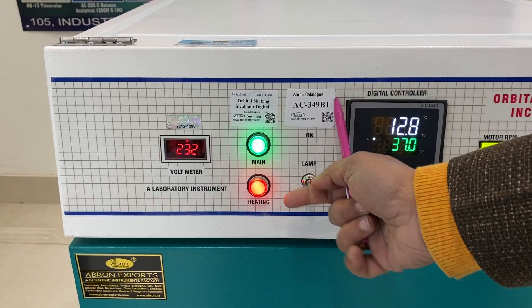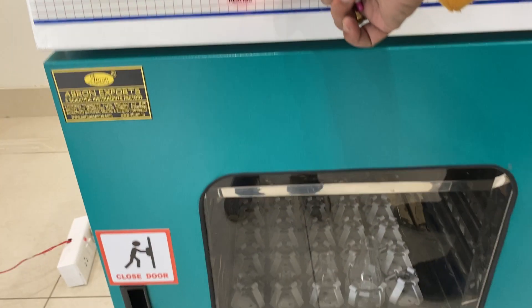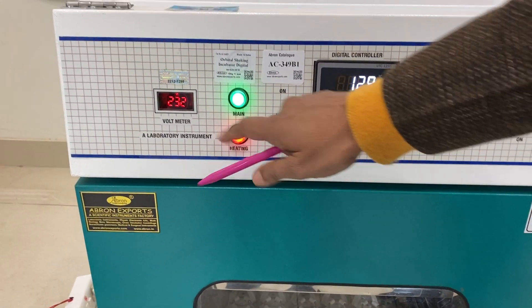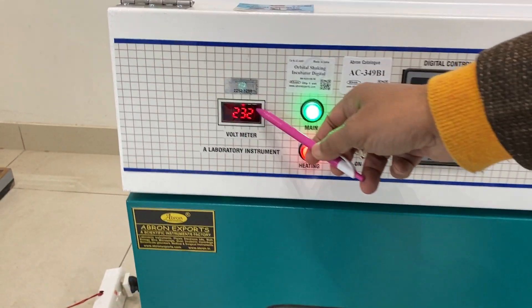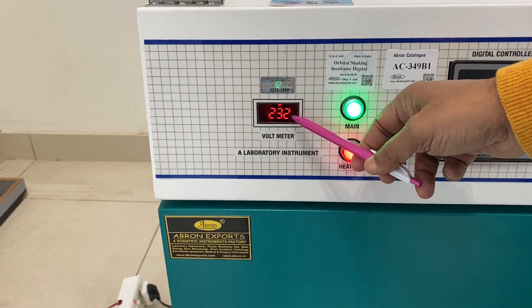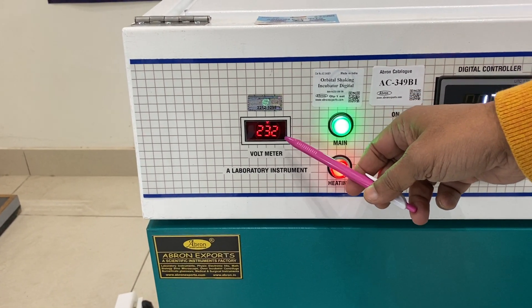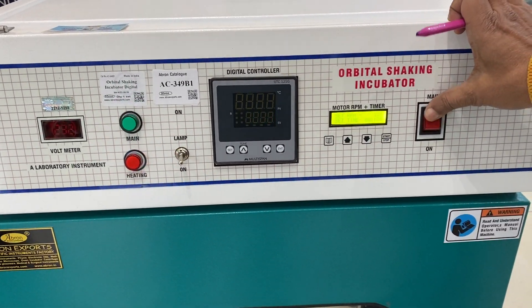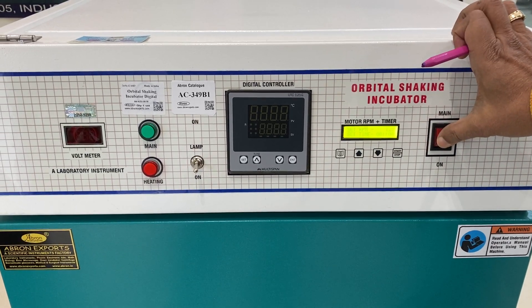This one is for the lamp inside — you can see there is a lamp inside when you switch it on. This indicator tells you about the voltage coming in. It should be used at 220 to 240 volt AC. Here is the main switch.